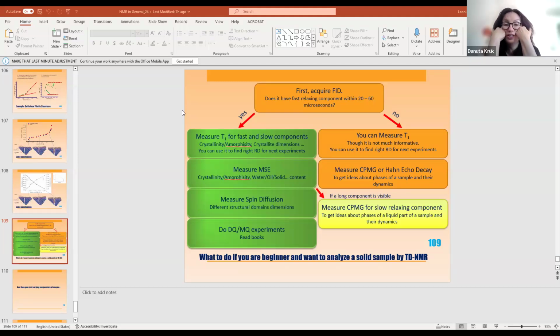Just take fluorine. But you have only one type of protons there. Yes, I have proton and fluorine. But talking about protons, are they all in equal condition? Exactly. But since you're observing double exponential decay, they are not equal.